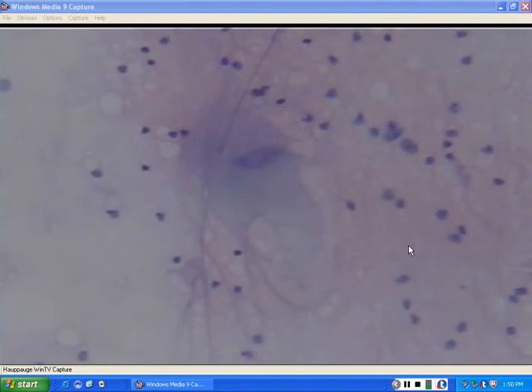So that's really a few of the structures that you'll notice that are pretty evident and let you know this is a nervous tissue. Where this is located is the entire nervous system, and its function is to transmit nerve impulses, either the senses of touch, taste, and smell, or the basic motor functions to innervate the muscles of the body in order to move the skeleton.